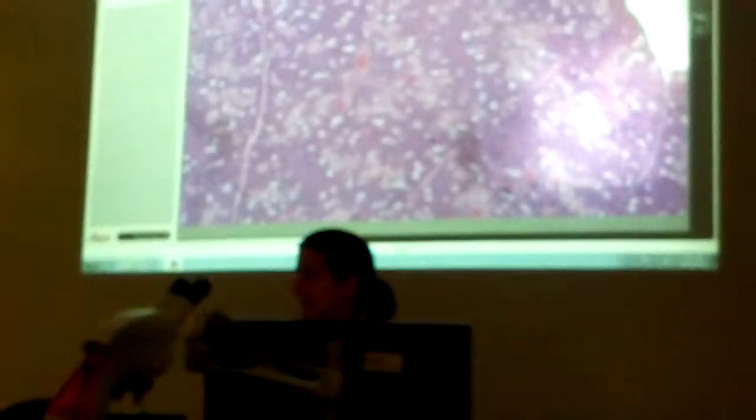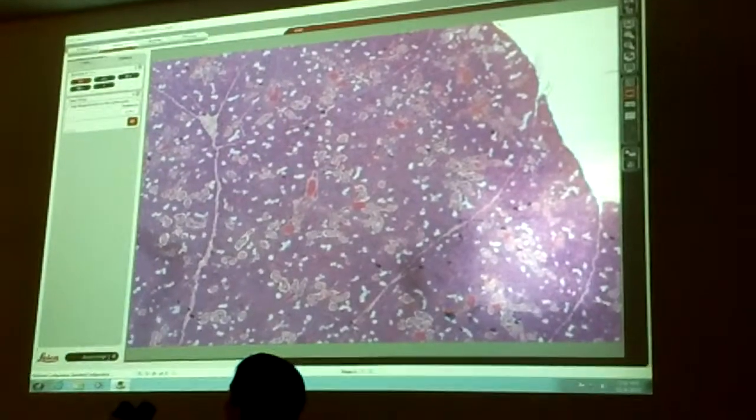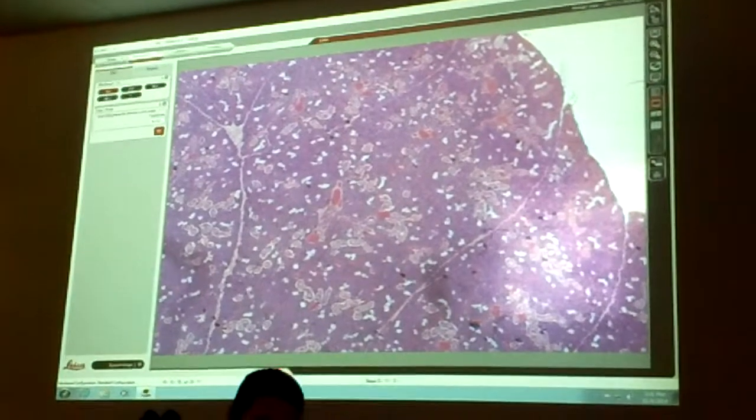All right, so on the submandibular, three structures. Again, these are going to be almost the same as the sublingual. So the mucus acini, the serous acini, and the salivary ducts. On the submandibular gland, the serous acini is going to be the majority of the types of structures in this. The salivary ducts, and anytime you see the word duct, you're looking for a circle of cells. And then the mucus acini are cells that will remind you of mucus.